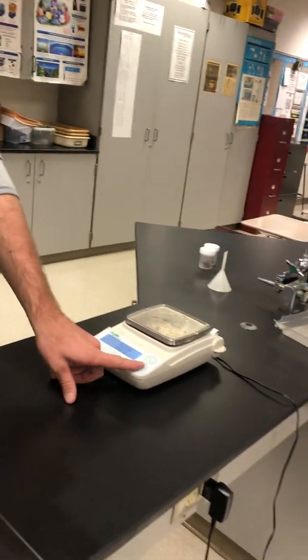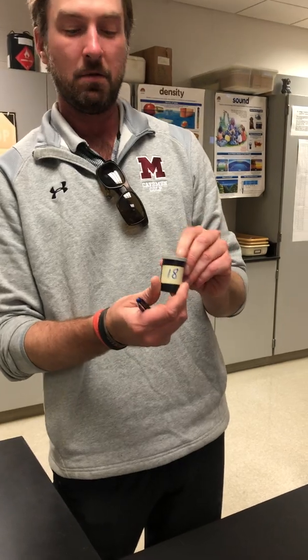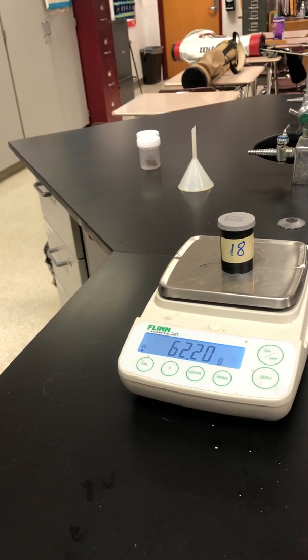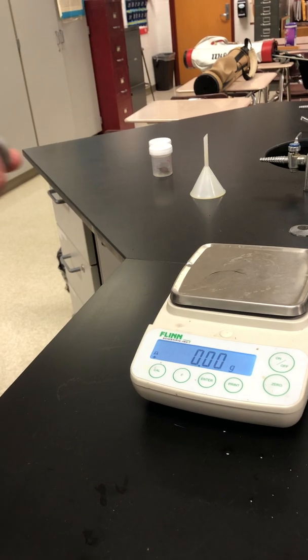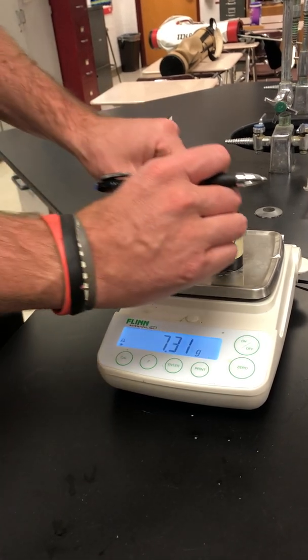Last names between the letters N and R, you're going to be container 18. The container has a mass of 62.0 grams with the pennies in it. And without the pennies, the container has a mass of 7.31 grams.